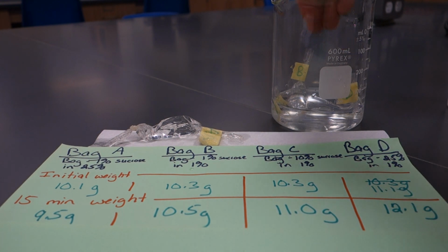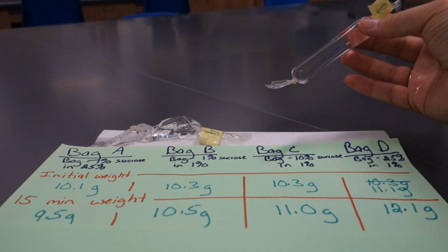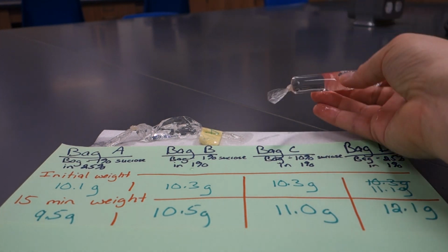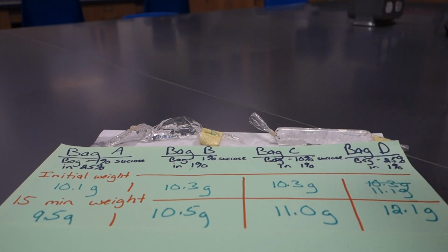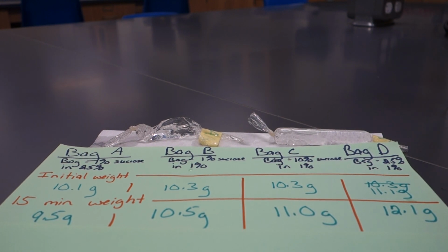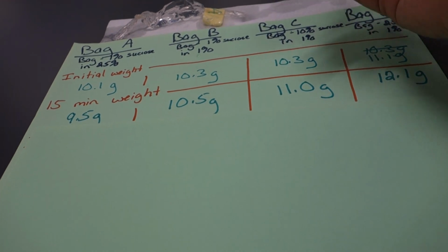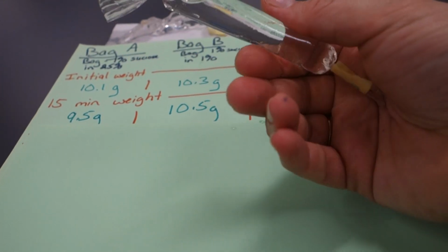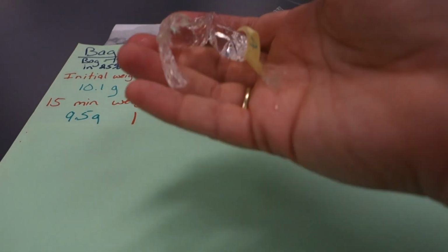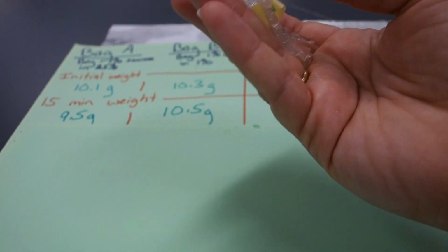But let's compare that to bag D. Bag D is big. It's firm. It's what we would call turgid if we were talking about a cell, especially a plant cell. It is very firm and contains a lot of structure. So that helps give us some evidence, even more than just the weight numbers we're going to look at. At the end of the time that we looked at, bag D was very firm, right? It even looks like it's gained weight. Bag A is really floppy, like I can literally bend it in half. It has obviously lost weight.